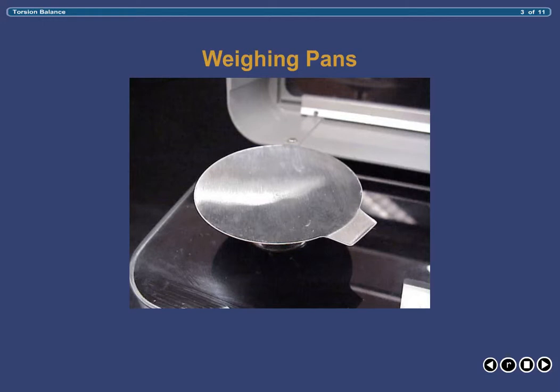The weighing pans, located on the top surface of the balance beneath the lid, are the part of the balance where your products as well as the offsetting weights are placed. These pans are made of stainless steel and are removable. It is imperative that these pans be absolutely clean and centered on the weighing arms prior to weighing. Products must never be weighed directly on the pans. Always use either a plastic weighing boat or weighing paper, to keep the pans clean and prevent any chemical reaction between the product and the pan itself.